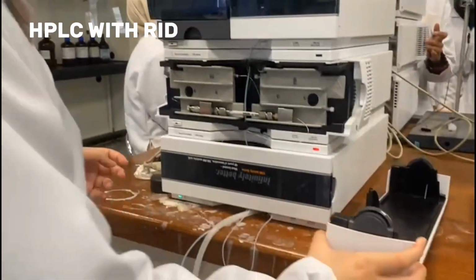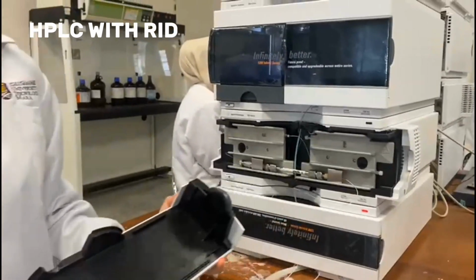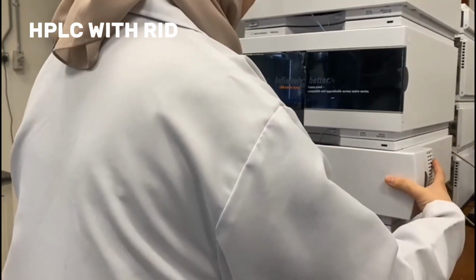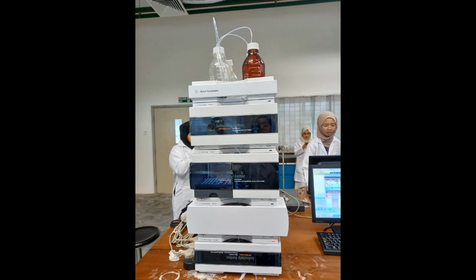The analytical column contains the stationary phase, which interacts with the sample components as they pass through the column. The stationary phase is the immobile part of the chromatographic system, and it interacts with the mobile phase and sample components to facilitate separation. The choice of stationary phase depends on the nature of the analytes and the separation goals.